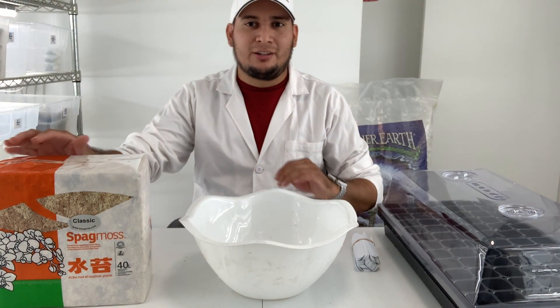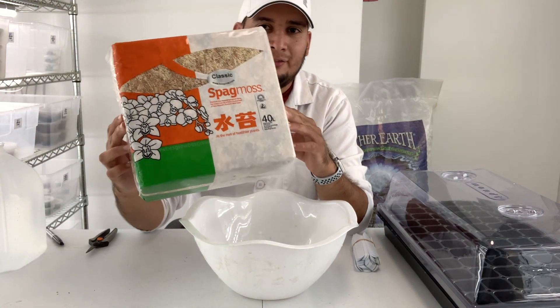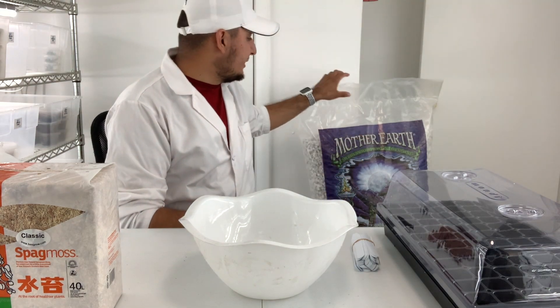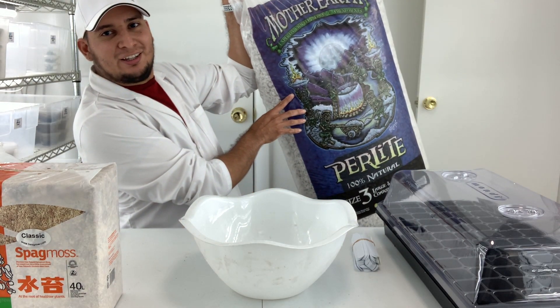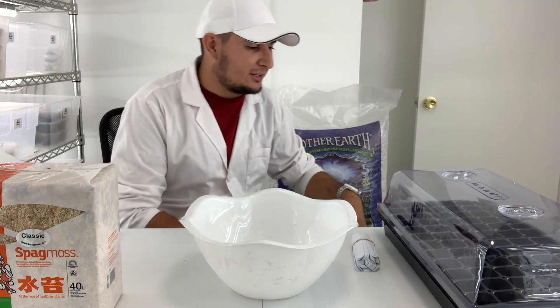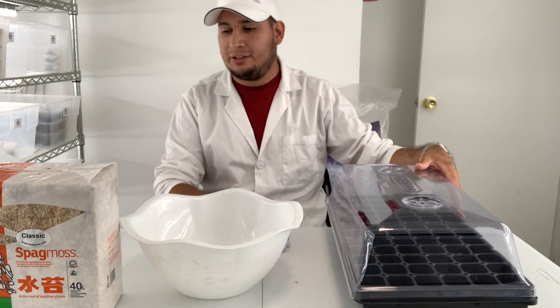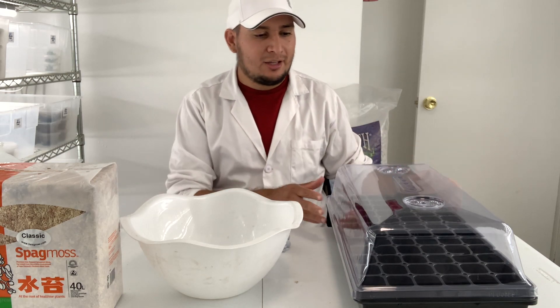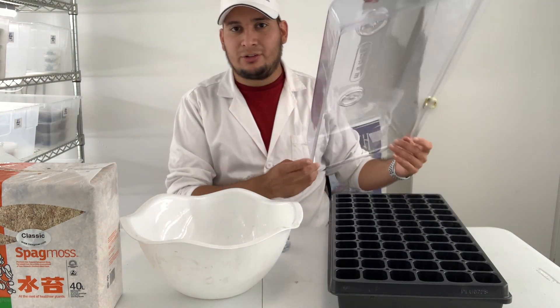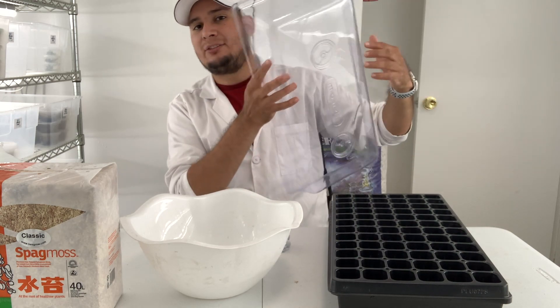So what I got here is New Zealand sphagnum moss — this is 40 liters, it looks very small but it's actually 40 liters. I have a four cubic foot bag of perlite, very coarse material. You don't have to be this fancy — you can use pots and some seed bags — but in my case I want to use a tray cell. This humidity dome actually has vents on it.